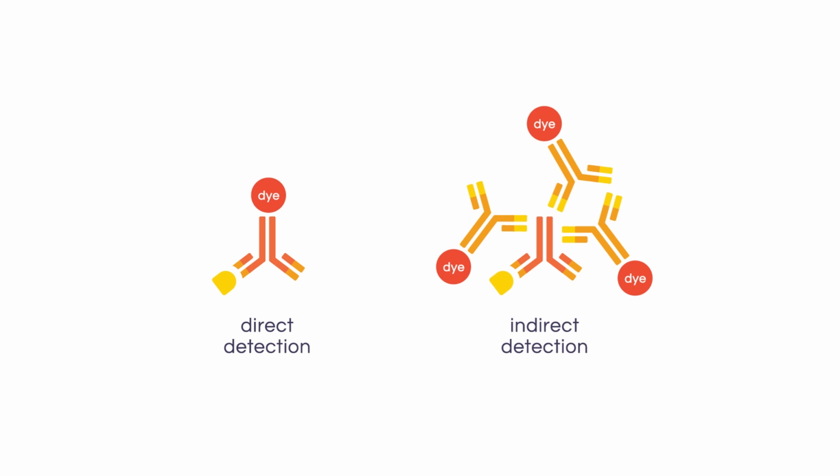It also serves to amplify the signal, as several labelled secondary antibody molecules will bind to a single primary antibody molecule. Because of its many advantages, and because it is the most widely used technique, in these courses we will focus on indirect detection of your targets.